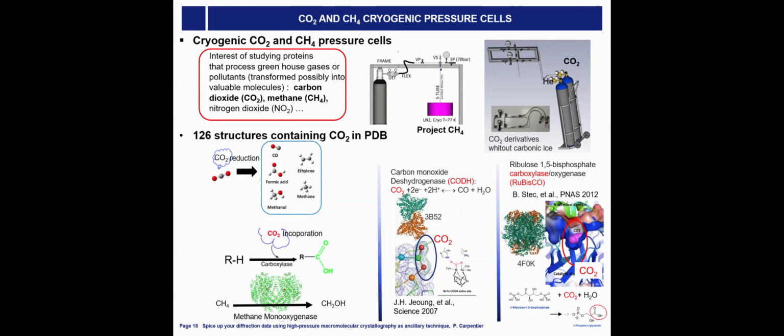Christina Ginovic Carugo, EMBL Grenoble. I have one first comment on the pressurizing with CO2. I think carbonic anhydrase is a very gratifying example to test the system if one needs to do so, where you can see very well the substrate bound.